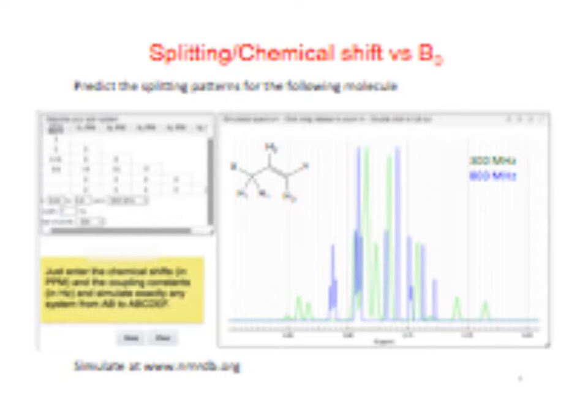So one of these must be H3, because it has the big doublet and the small triplets. It's still second order because we see this slanting up like this, but at least we see the right number of peaks. And then for H2, we also had a doublet of triplets, but the triplets were bigger. And that's what we see here. Here's one triplet, and here's the other triplet.